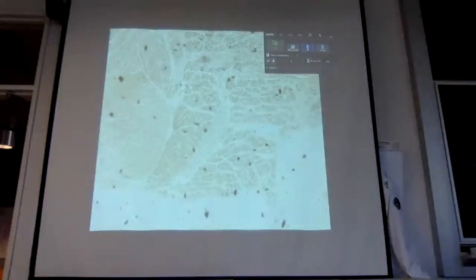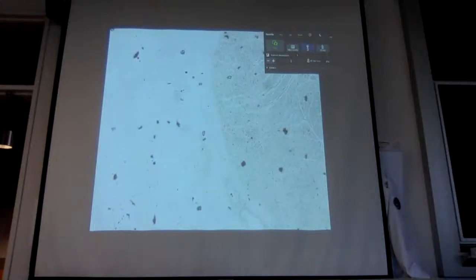How would you show it? How would I show you epimysium? This slide right here. I'd probably have to move around. This is 4x. Some junk there. This one's not the best. The one I have over here is not the best for epimysium. For epimysium, we want something like this.